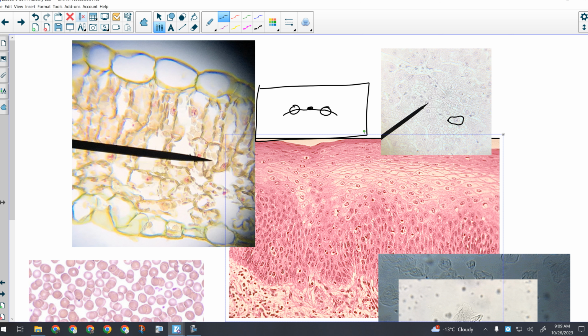Are we guessing the size of them? Yes, of a single cell, because you're diagramming an animal cell. You can't say the sample took up the whole field of view, so it was 400 micron. You have to tell me how big that individual cell was along its longest dimension. So each page we're doing exactly the same as last time, just labeling actual things? You're labeling accurately this time, yes. And how many labels are expected? As many as you can be reasonably certain of. We're also expected to measure each one again? That's what we just asked.